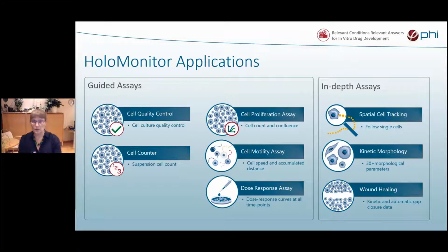The in-depth part of the software, those assays are more open-ended. You can extract a lot of different types of results, but more user input is needed. So combining, for example, the tracking with morphology is quite a powerful tool. So images from both guided and in-depth assays can be reanalyzed for other results.